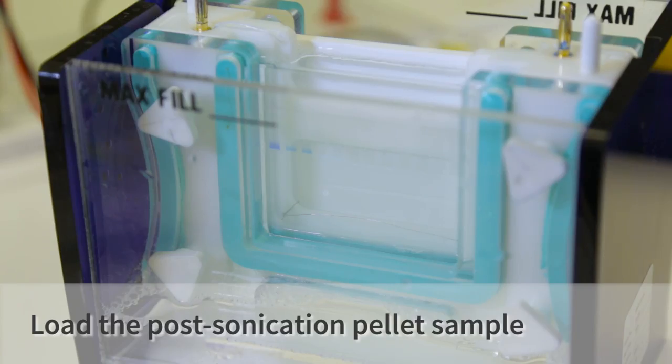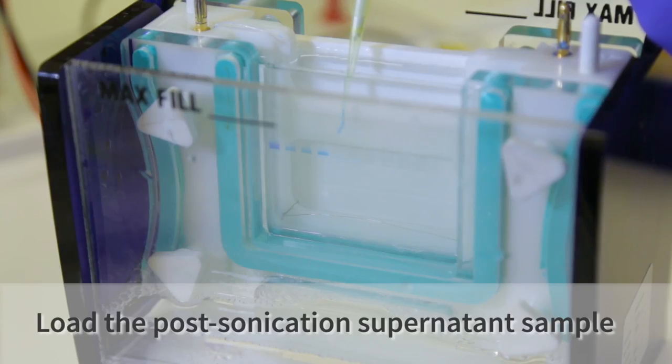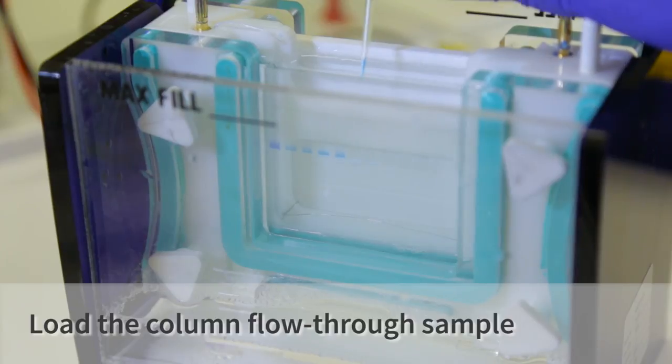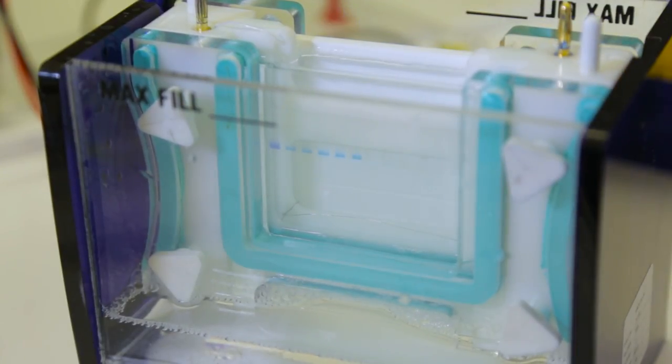The next sample we're going to load is the pellet, so this is the insoluble protein that shouldn't contain our sample hopefully. Now we're going to load the supernatant, so this is the soluble part of the protein fraction. Hopefully our protein is in here. The next sample is the flow-through, so this is any protein that did not bind to our nickel column. This should contain all the proteins the E. coli was expressing because they don't have histag on them and therefore can't bind to the nickel column.